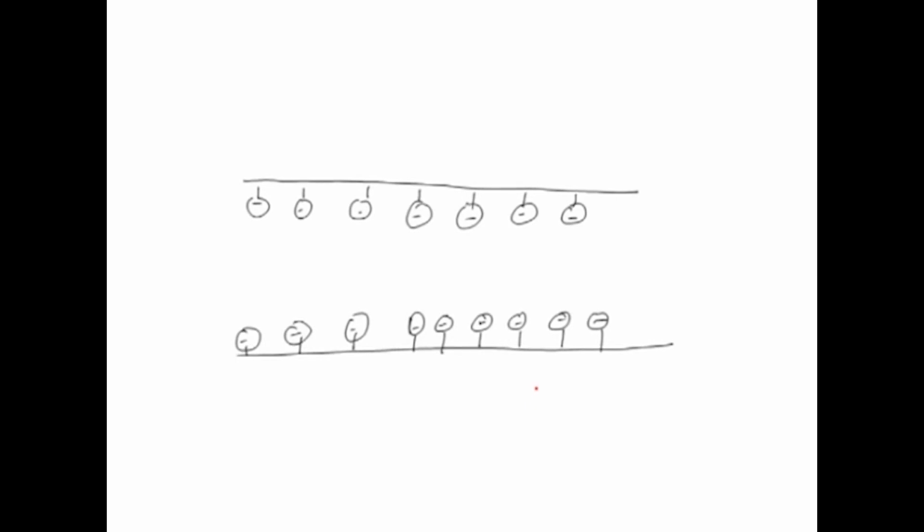Now, there is a particular electrolyte in the capillary. If you are utilizing a free solution here, then the solution inside this capillary will carry both positive and negative charge. Now, what will happen? This positive charge will be attracted towards the negative charge here. So, what you are going to see is that on the inner side of the wall, a layer is being created, which we call a double layer of negative and positive charge.